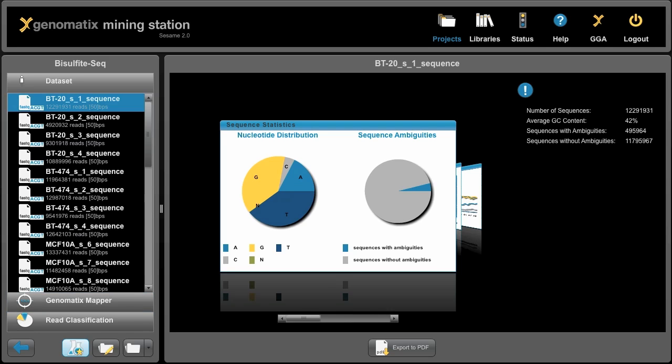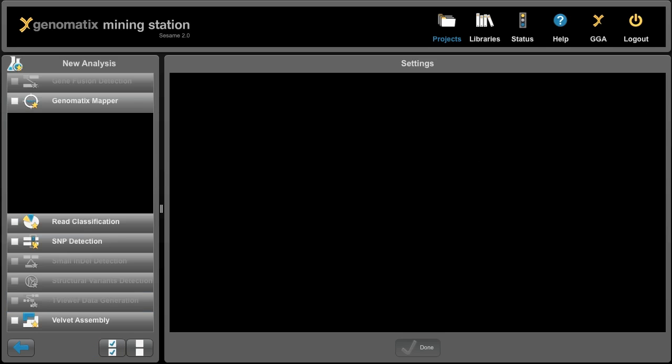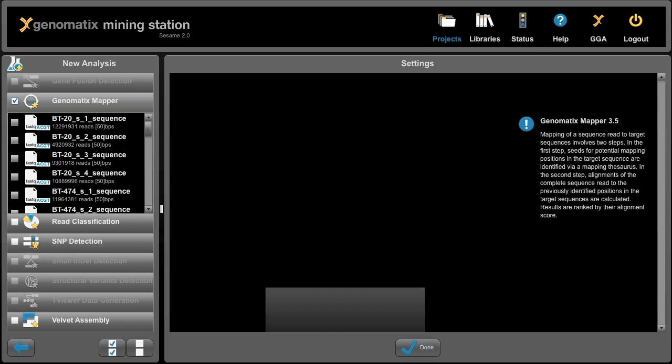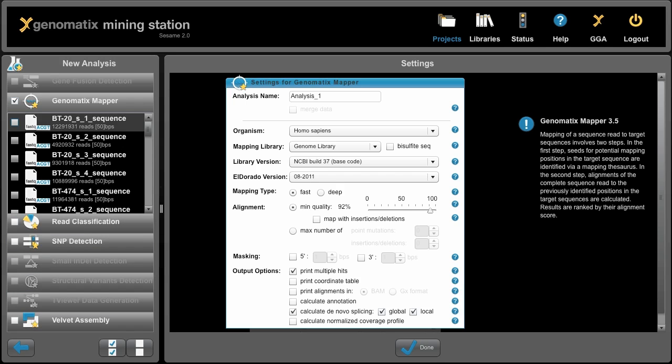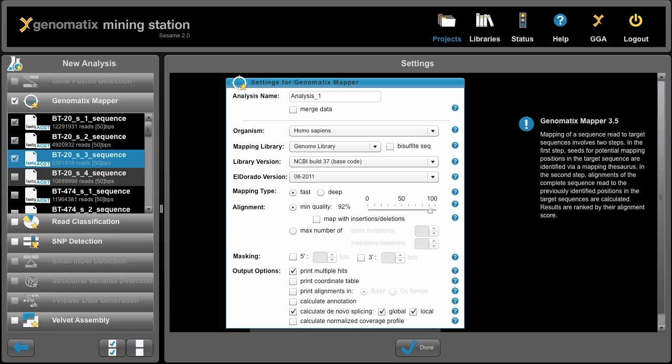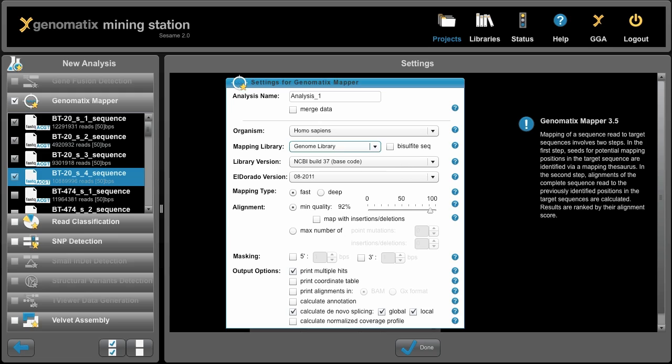Now to map these bisulfite reads, we can simply click on Genomatix Mapper. We can say we want to map all four lanes of the BT-20 cell line, which is a breast cancer cell line, from the human organism. We want to map that to the genome.